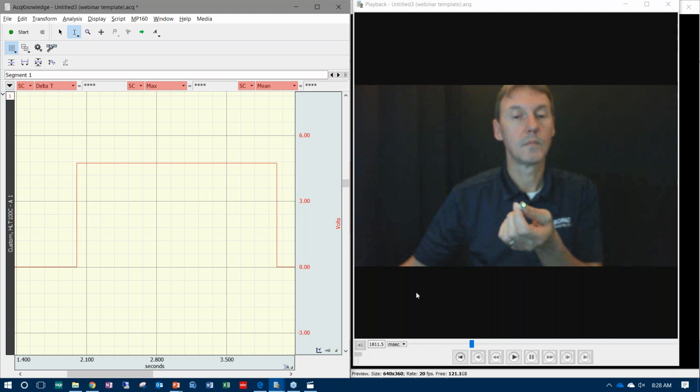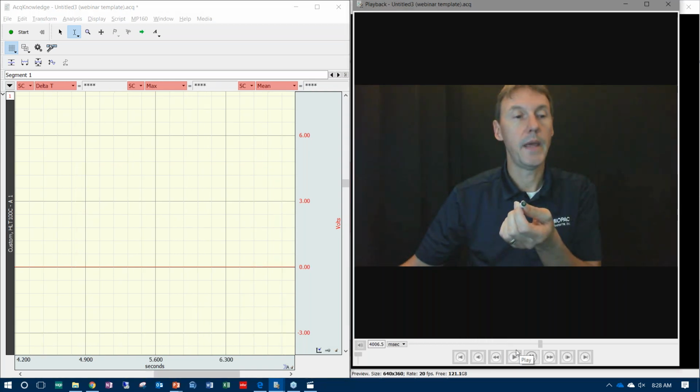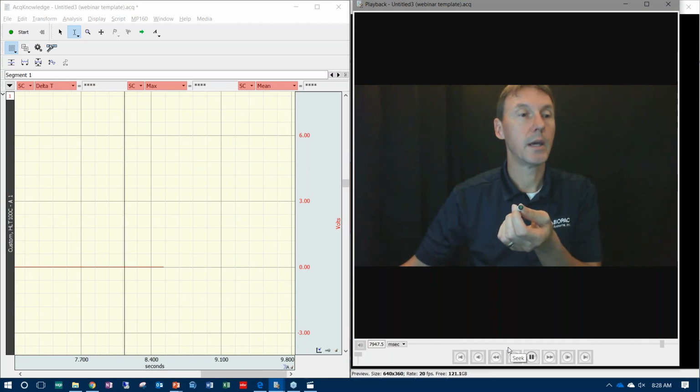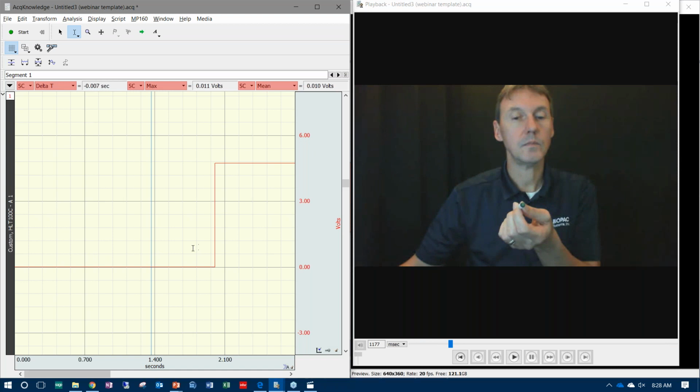Now, the nice thing in the playback mode, we can come over here. I'm not sure how this will work for you guys, but if I hit play, we can play back the video and we can see exactly what's going on. And it's going to come to an end. And now if I come back, it basically passes the cursor through without having to do this manually.